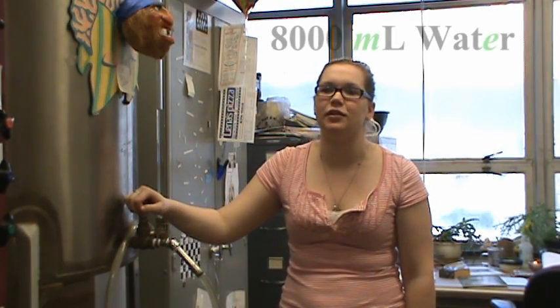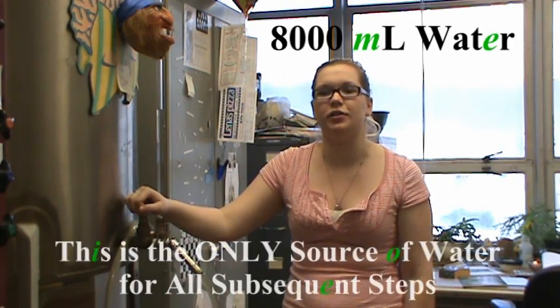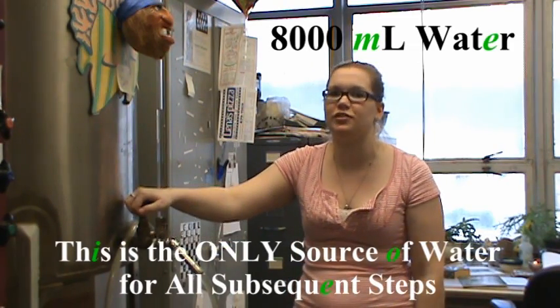Today we're going to be making a 7-liter batch. For that we're going to need 8,000 milliliters of water. This varies by a couple hundred milliliters depending on the season due to changes in humidity.